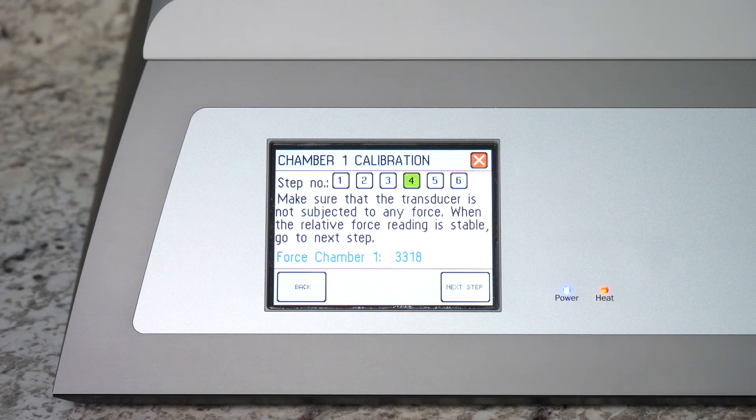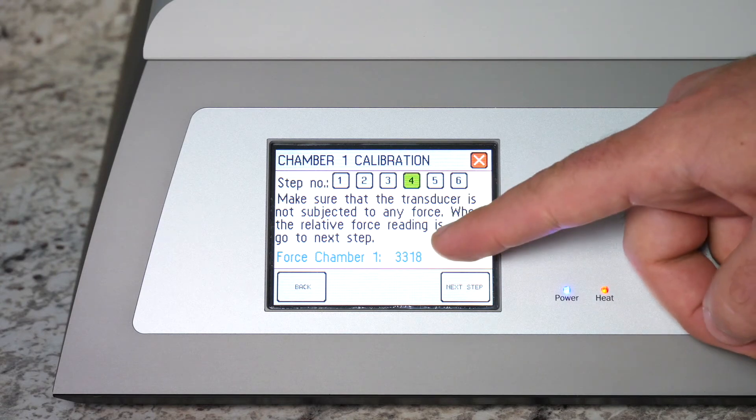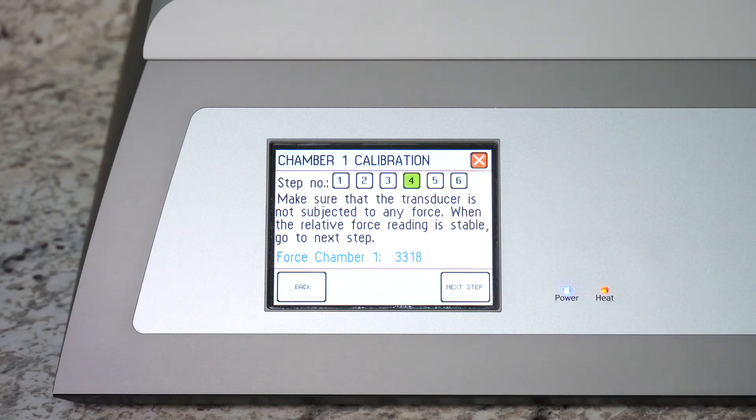Step four asks you to make sure that the transducer reading is stable. In this instance the reading is stable but if it's going back and forth between two numbers that's all right. You can give it a couple extra minutes or you can go on.